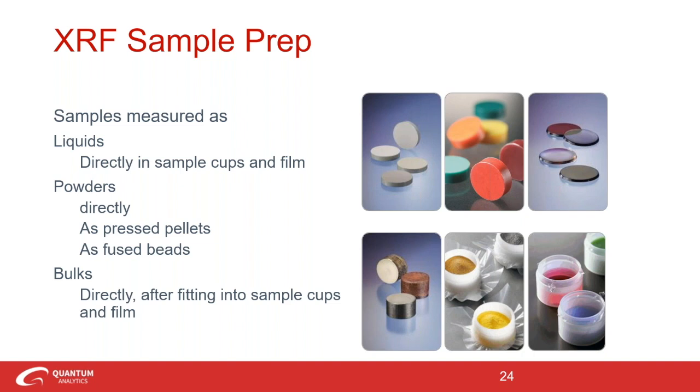So you don't want them sitting around for a very long time, and you want to try to minimize your analysis time to the most efficient timing, especially with samples that tend to evaporate. Samples should not stratify during analysis. Samples should not contain precipitants or solids, and analysis could show settling trends with time, right?